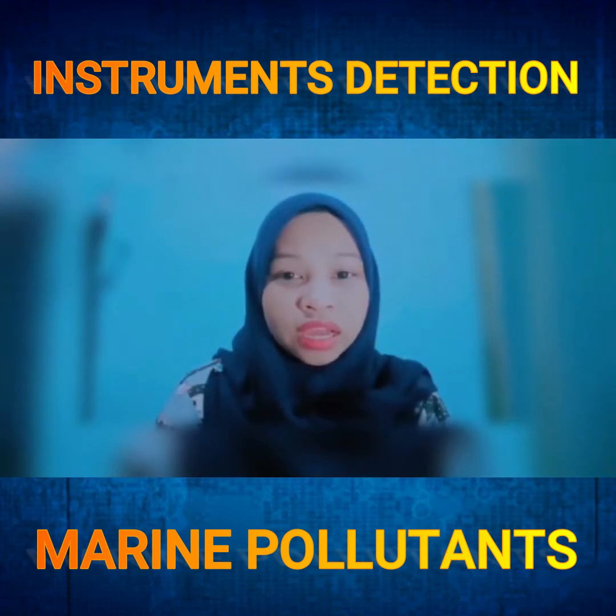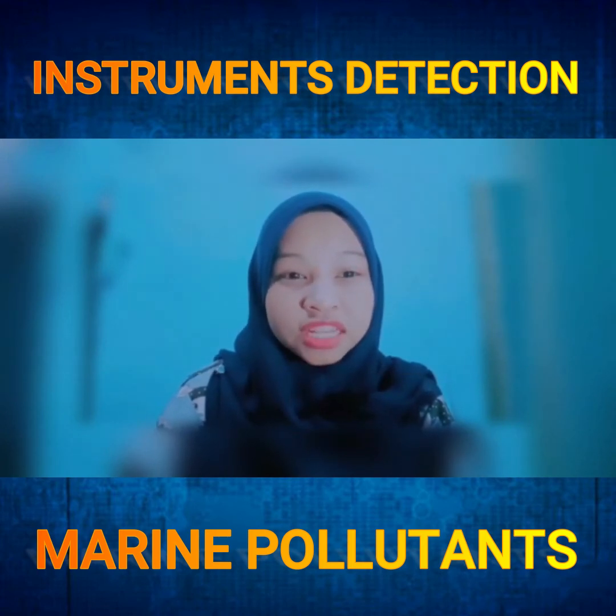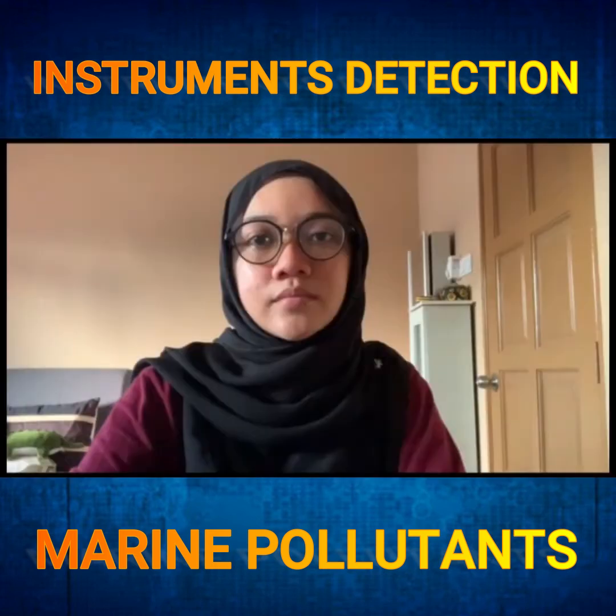Okay, the last one, the type of pollutant that can be analyzed is heavy metal pollution assessment, which are ferrum, chromium, cuprum, and zinc. Mostly it's found in soil in the vicinity of industrial areas. It's because the soil near a pulp and paper mill was found to be highly polluted by heavy metals.